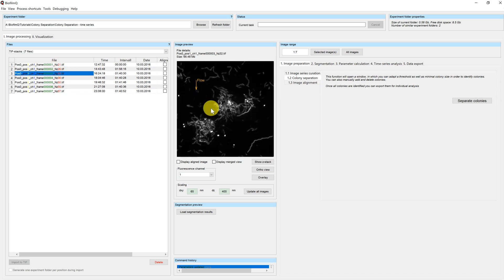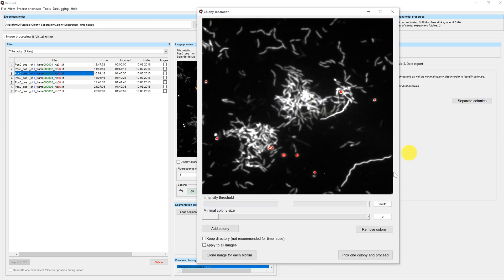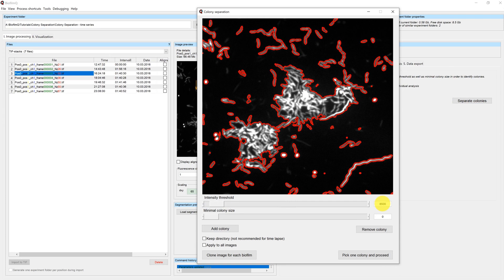To separate those two, we use the colony separator again. Just quickly modify the settings so that the two microcolonies are separated.